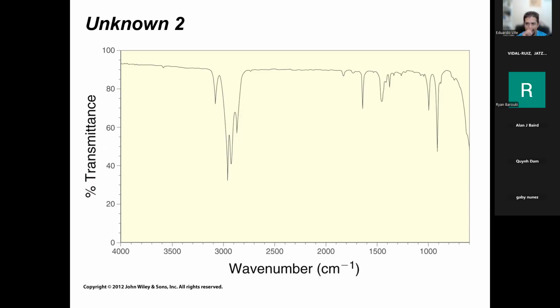Well, let's take a look. A secondary amine is a weak signal, right? And usually it's found between 3200 and 3400. So if we look at this whole region, we see that it's just very slightly out of range of where we might expect an amine. And yes, the peak is very sharp, right? And it's also very slightly to the left of all of the stalagmites. So this whole region in general is a CH region. So the fact that there's one peak in the CH region that is sharp, a little bit higher wave number, that tells me this is a stronger bond. So yes, this one would be for sure.